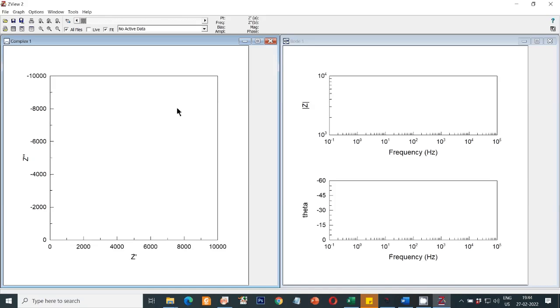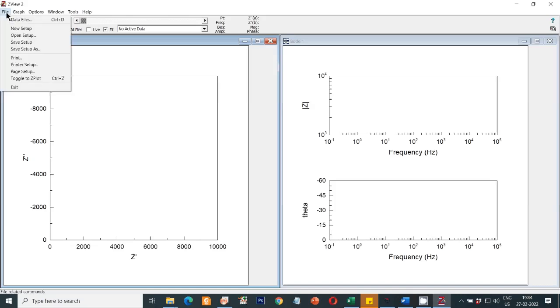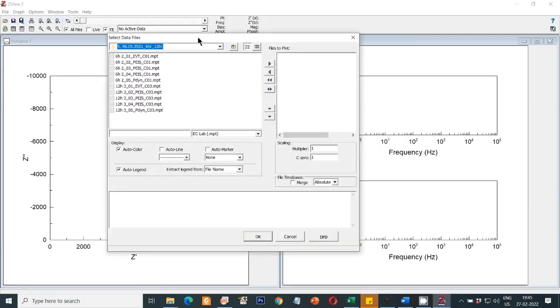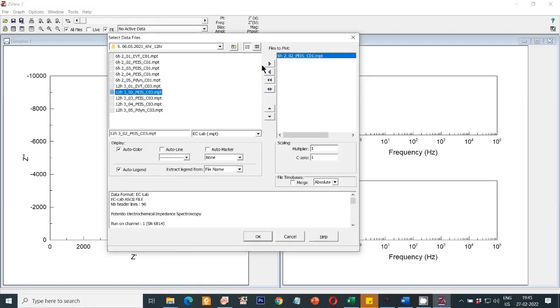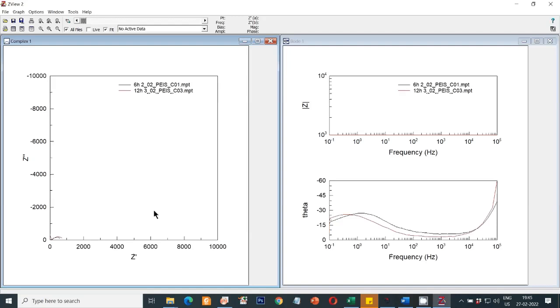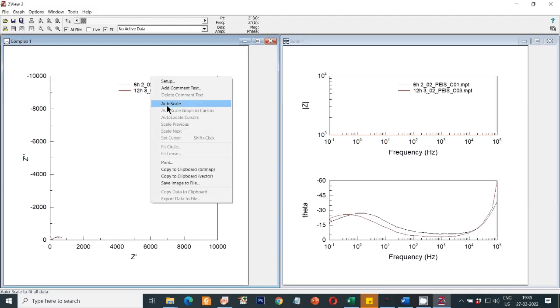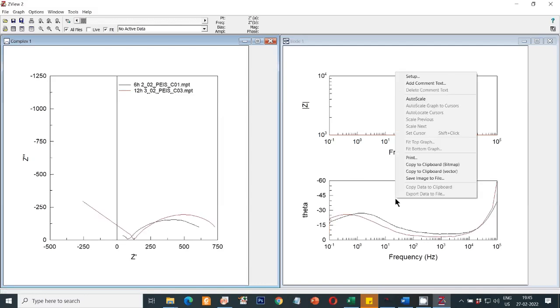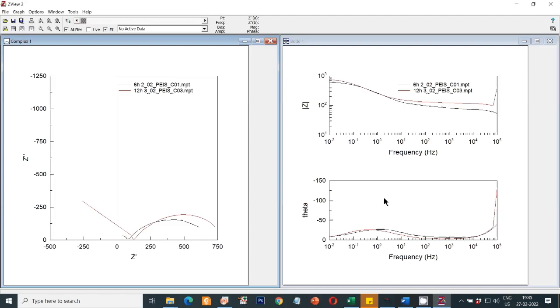Let's begin with the ZVUE software analysis. This is the ZVUE software interface. To add files, select Files and then Data Files option — a dialog box will appear from where you select your files and add them. You can add multiple files for comparison. I have selected two files here. This is the Nyquist plot and these are the Bode plots — two plots appeared because I selected two files. Right-click and do auto scale, and do the same for Bode plots.